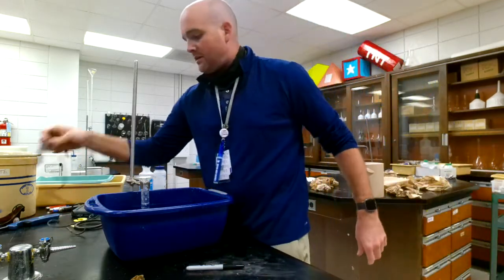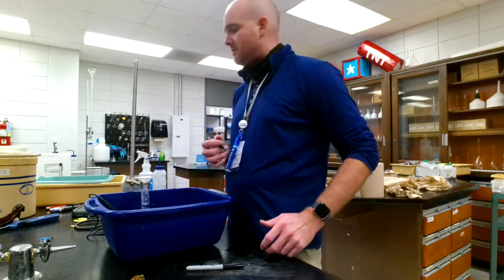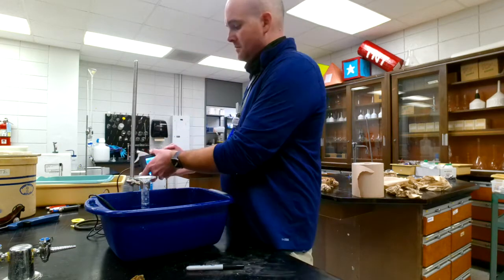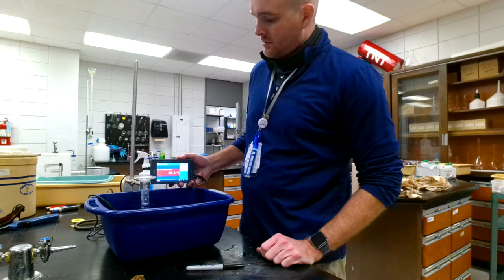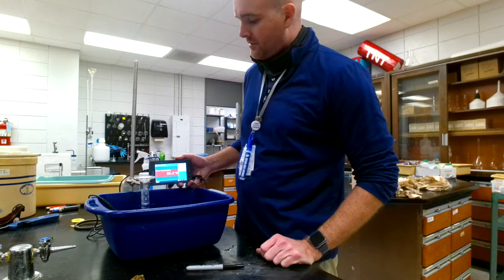And so the temperature of the water is, surprise, surprise, probably around the temperature of the room, which is 23.2 degrees Celsius.